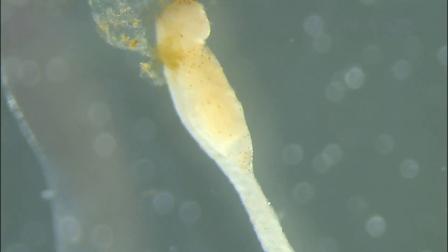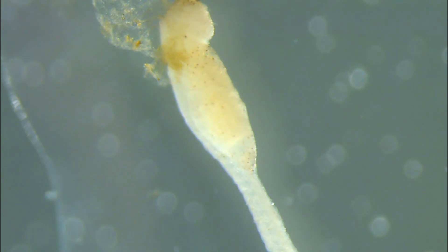And you can compare that with this guy who's a gizzard shad. His pre-count is like 39 and his post-count is maybe seven.